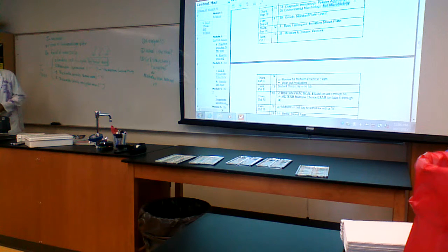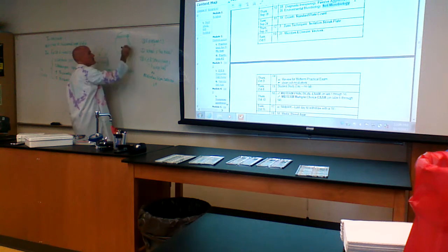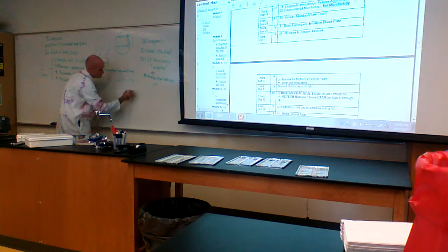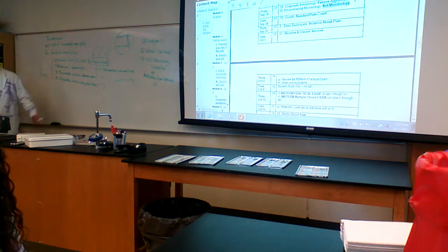Isolation streak plates. The only question I can ask is, did it work well? But you should know what you were looking for. So you should be able to look at a plate, and if it looks like this versus this, which worked better? Second one. Yeah, that's about all I could do on that one. It's sort of a technique. What were you looking for, and which one worked better?